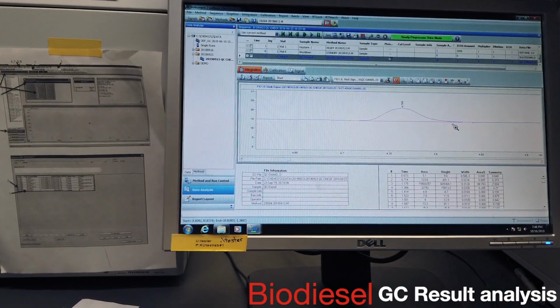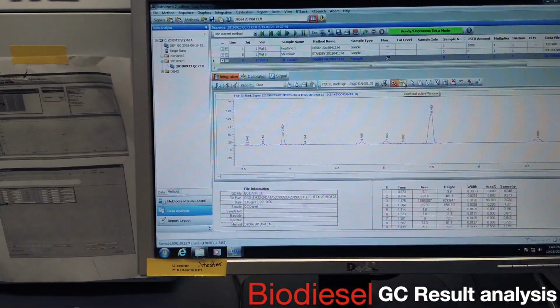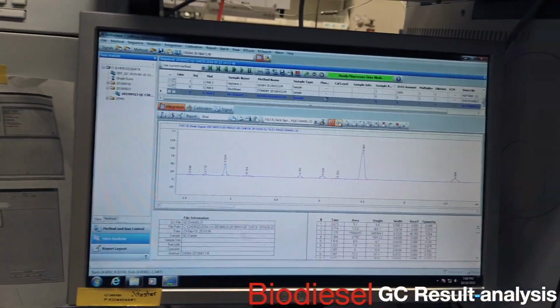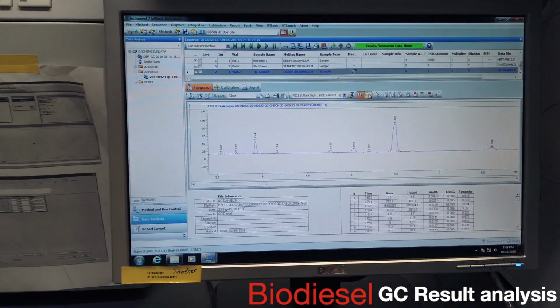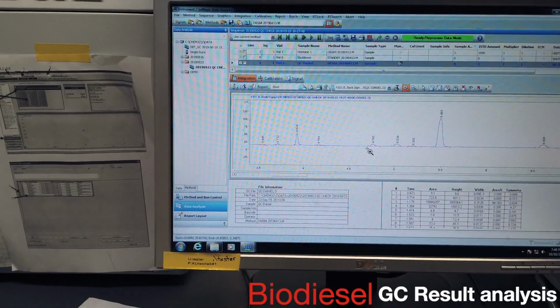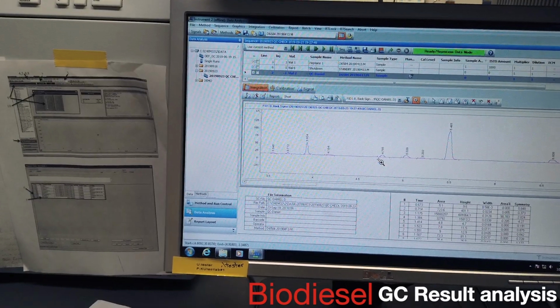Yeah, that looks like you got all the areas. Okay. So what is this now? I was just kind of going over, so we're done. Everything's good. I was just going over that you're going to go through and say, okay, I know glycerin's 4.7. So I'm going to look at this peak and ask, does this look good? Does this have all the area represented that I want?